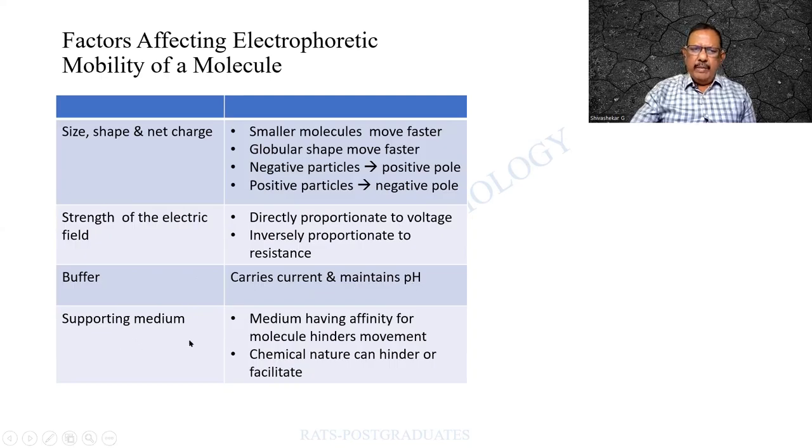And the supporting medium, as I told you, has an affinity for the molecule. When it is too much, it hinders the movement. At the same time, when it is not much, the molecule moves faster. And the chemical nature also can hinder or facilitate.